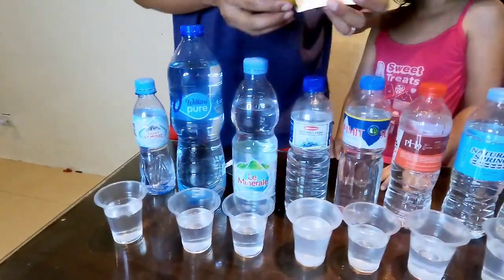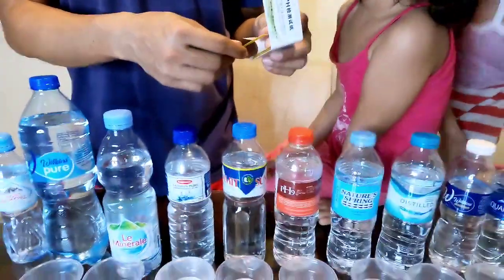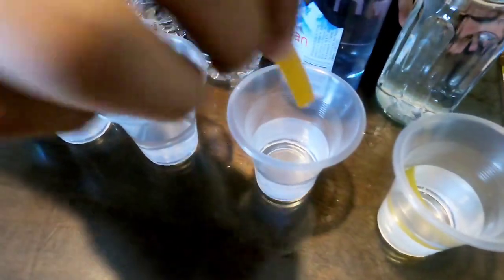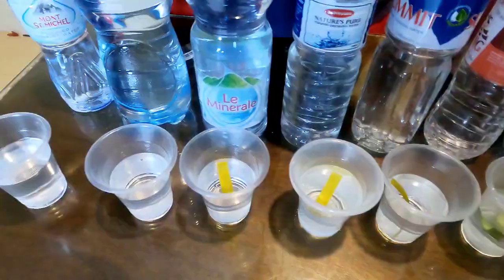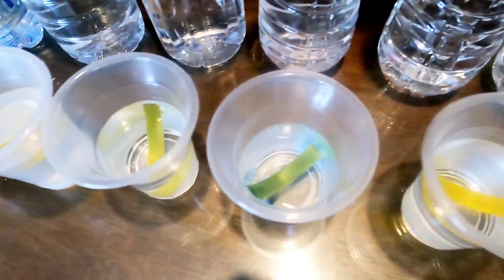Alright, the next step is to put the pH tester in the water. It's yellow at first, but it will change color. Let's start here and pour it in. The green and yellow are mixed together — it's green. Can you see that? It's color blue, it's dark. Wait, it's purple.